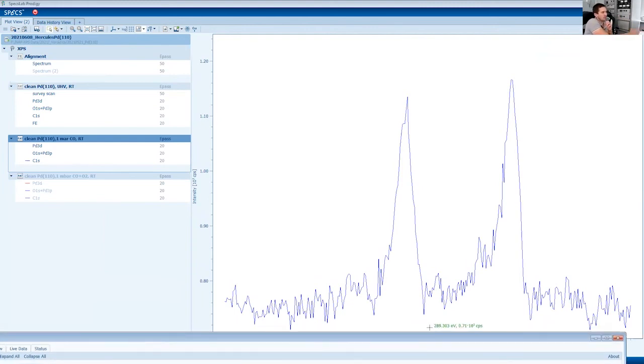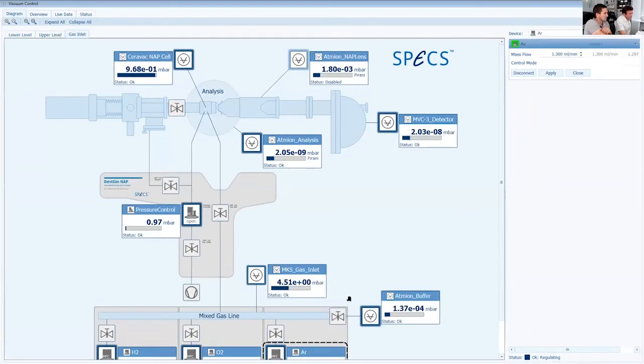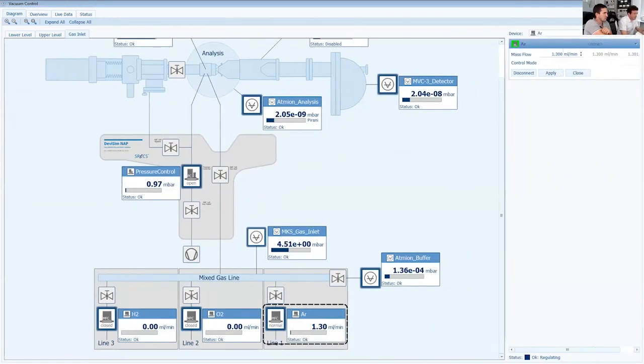If you want to have more or less good data, not very noisy spectra. As soon as you have noisy spectra, it is problematic to fit them because you don't know if this here is the peak or only the noise. Sometimes it happens. We have experiments where the active metal content is about 1%, and when you have a powder, press it in the mesh, you have it in 1 millibar of the reaction mixture. It's really difficult to see something. We sometimes did 160 scans, maybe for 3 hours, and it finally didn't actually work out.